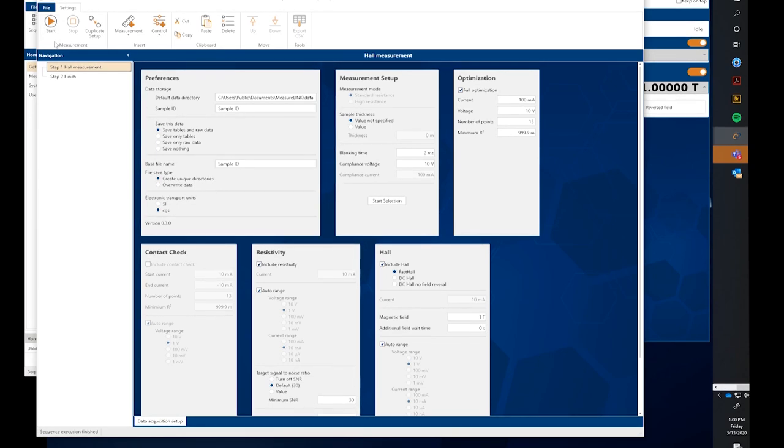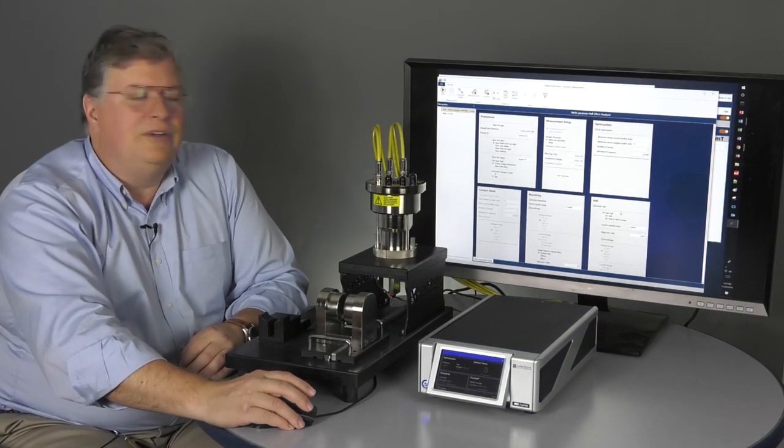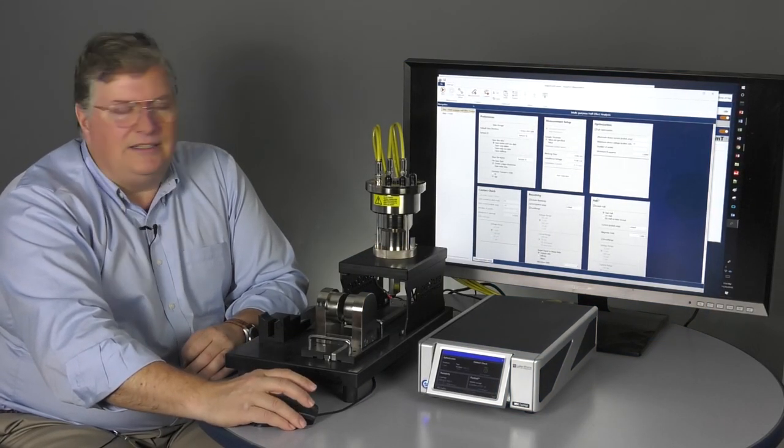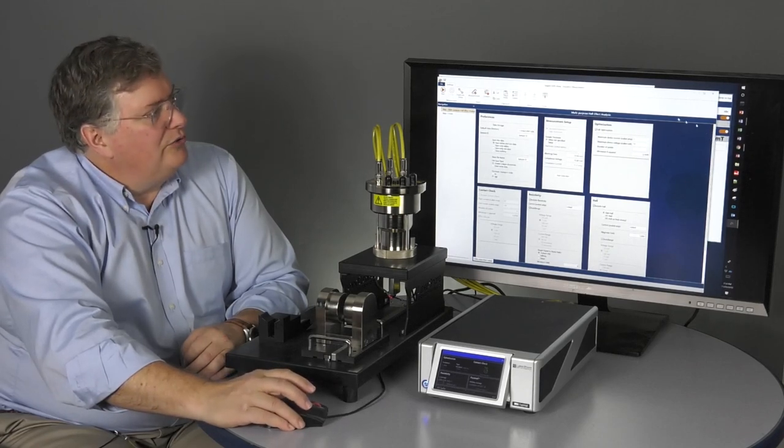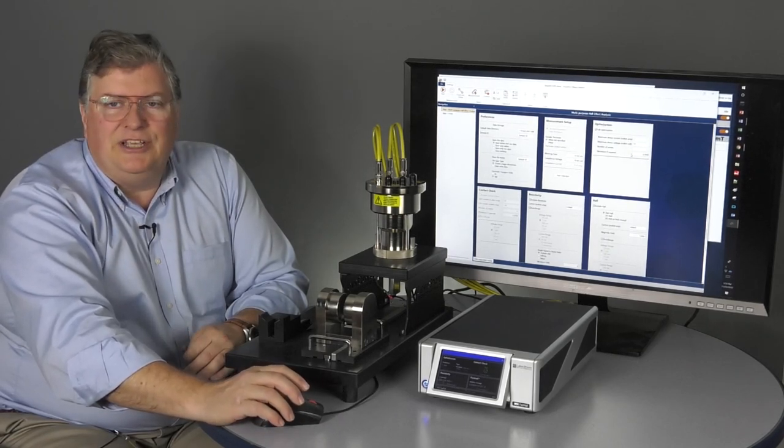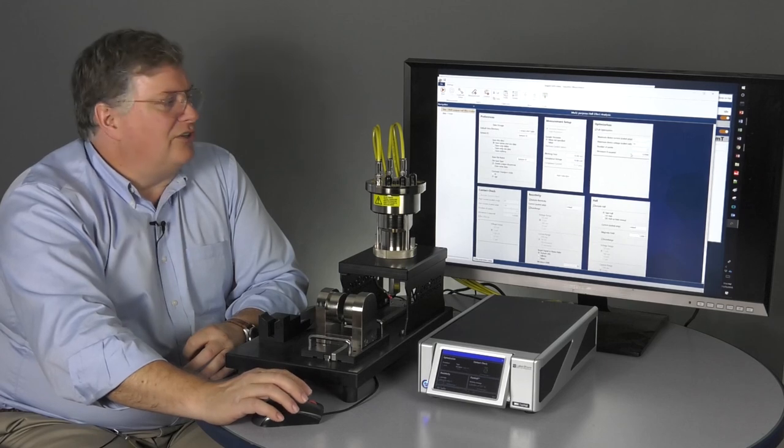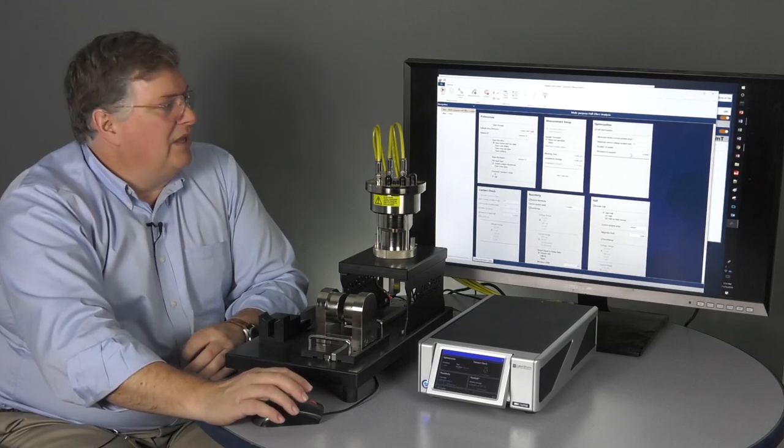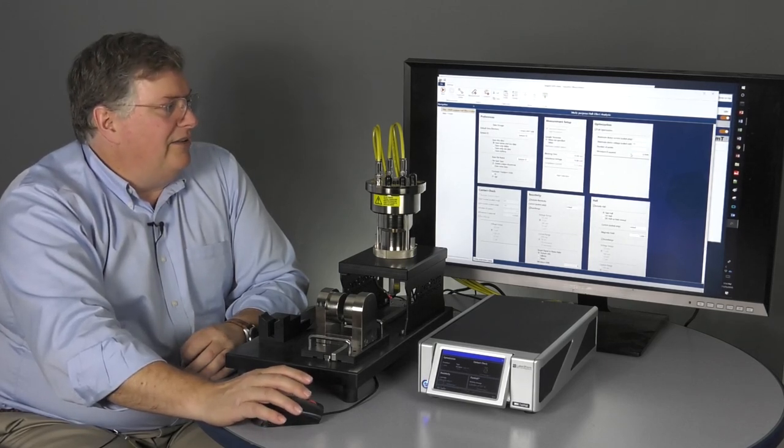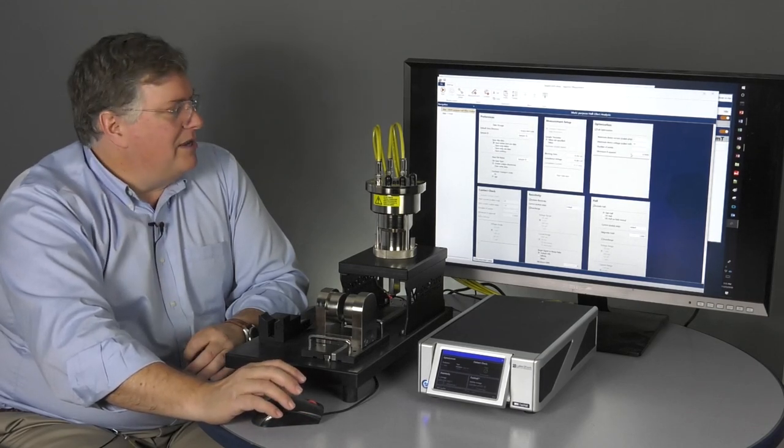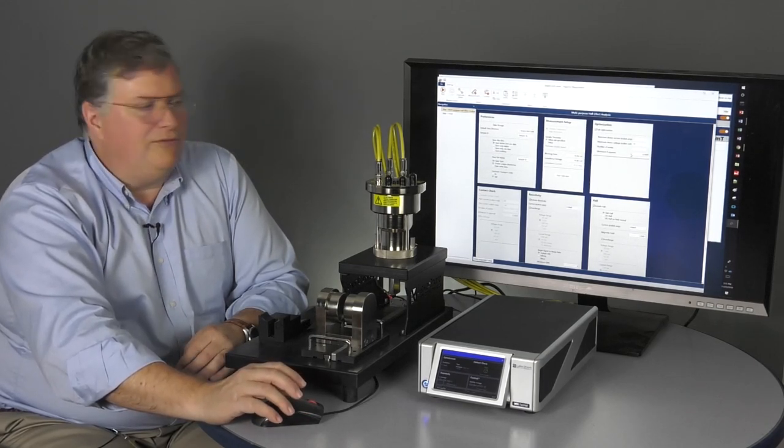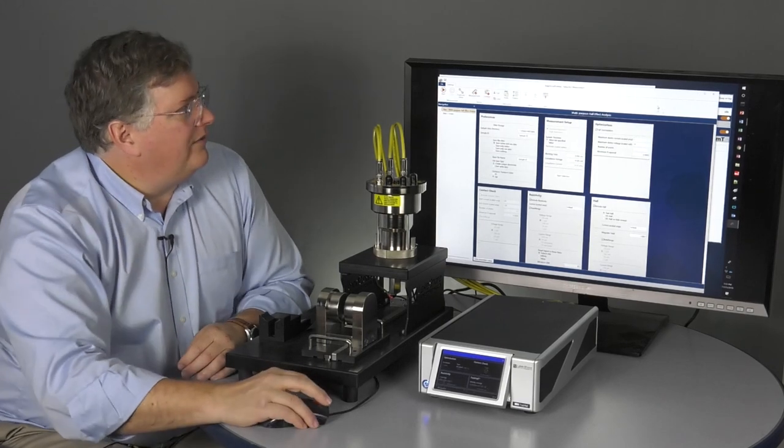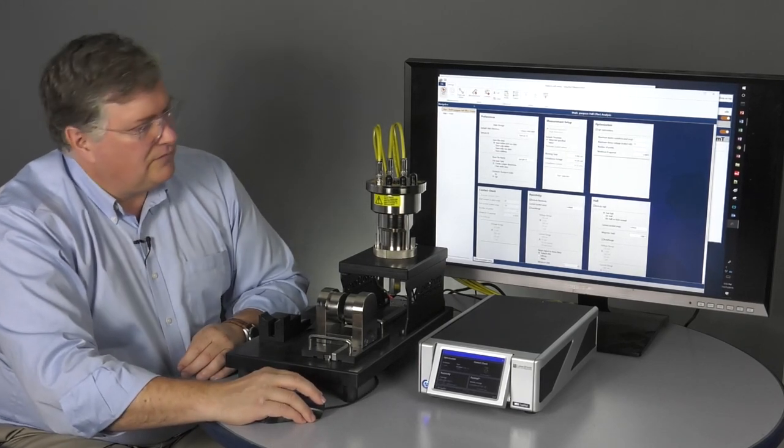This will now complete the optimization. It will then automatically do a contact check, run the resistivity and hall. And notice here on the resistivity and hall, I haven't specified an excitation value. What it's going to do, it says linked in the window. We're going to run the contact checks for optimization. That's going to use that excitation current to run the resistivity and also the fast hall. And then also the fast hall will link in the resistivity that we measured in the previous step to make the full determination. So, all of that will happen when I hit the Start button.